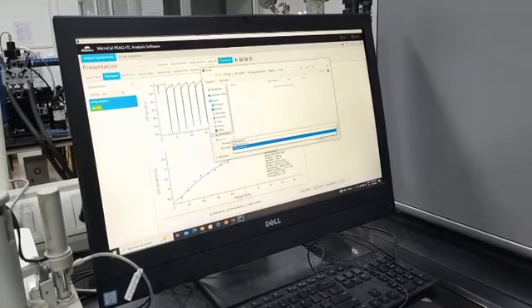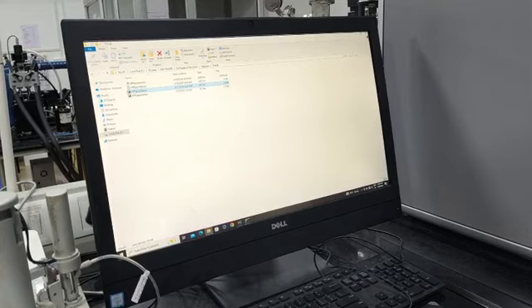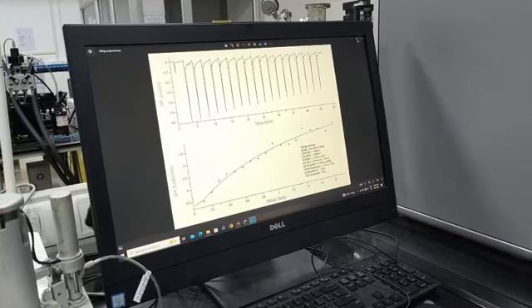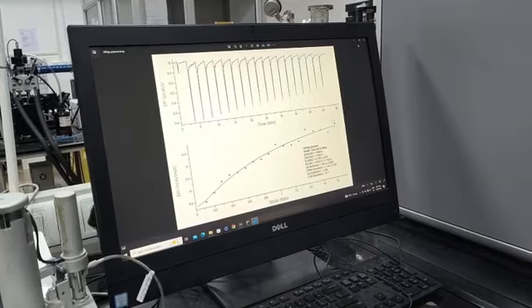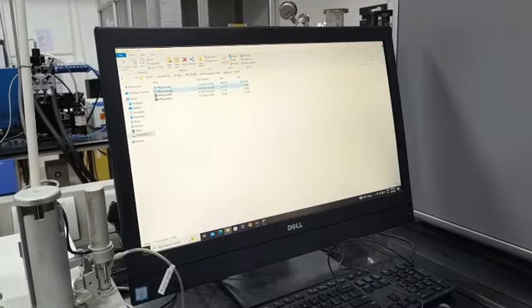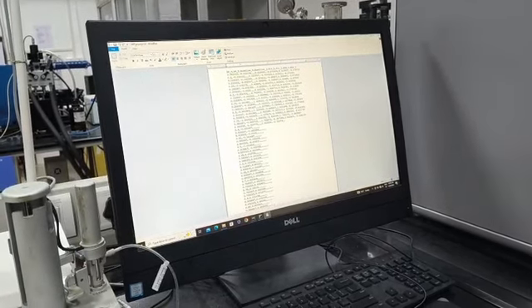Okay, now it will keep it in JPG format, it's done. Whenever you have this, you have already created 3. This one is an image for just a quick look, right. I'm not talking about the analysis part, this is a mechanical way of how to use the software. Next is this CSV.